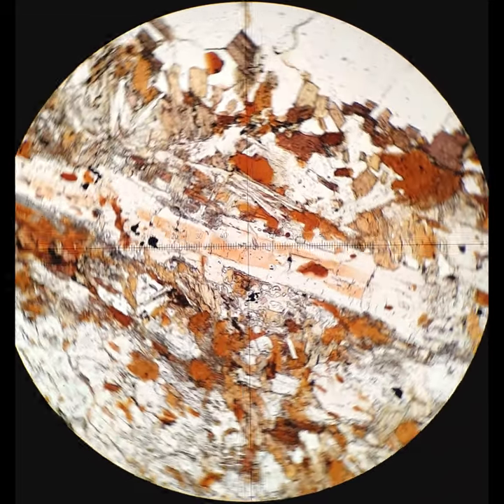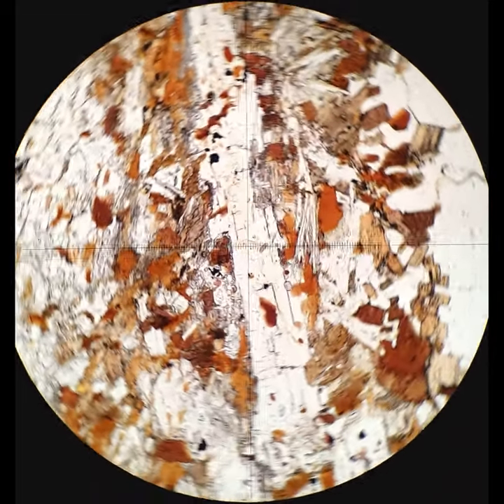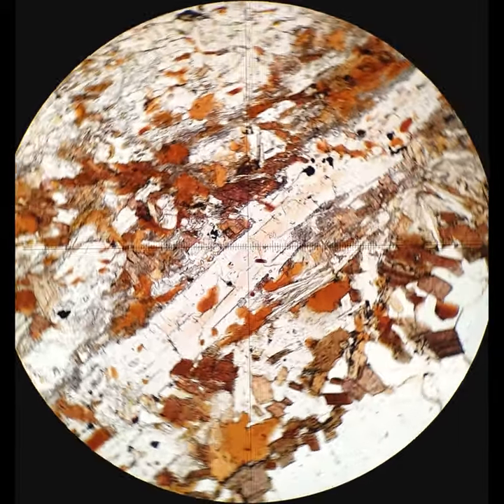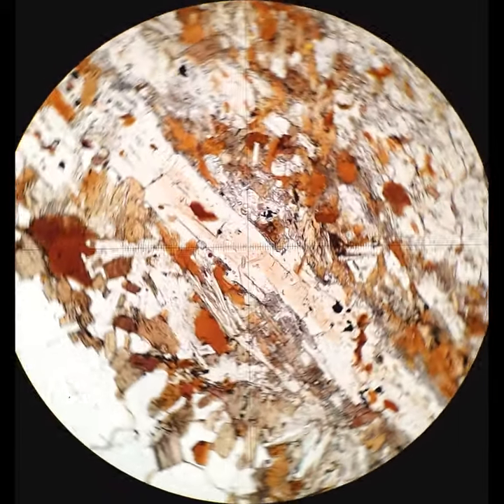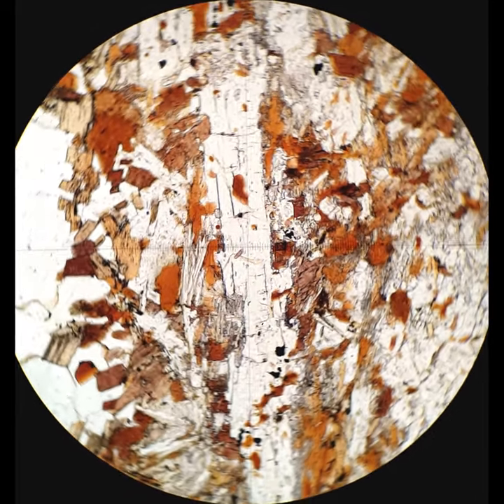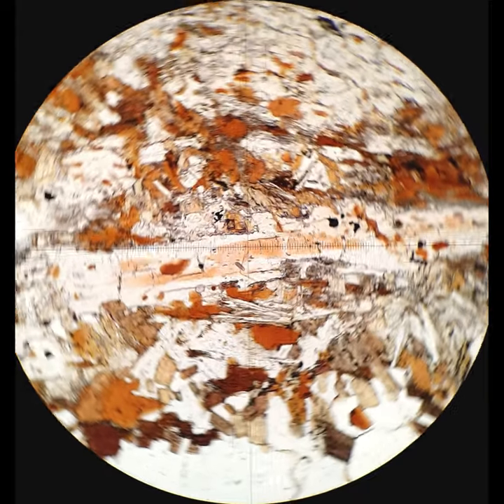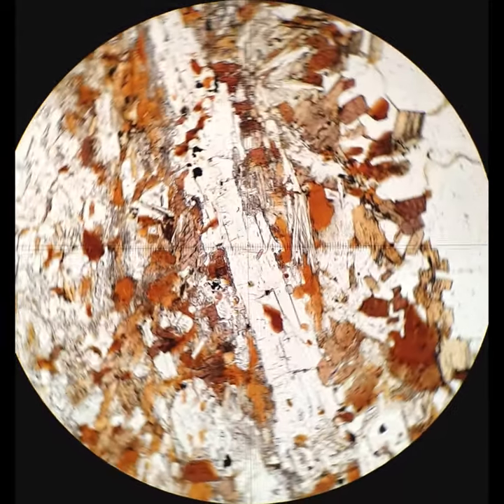A certain composition — andalusite — has distinctive pink pleochroism, commonly developed in andalusite cores rather than rims. So I interpret this as an andalusite crystal largely because the cores have this pink pleochroism.